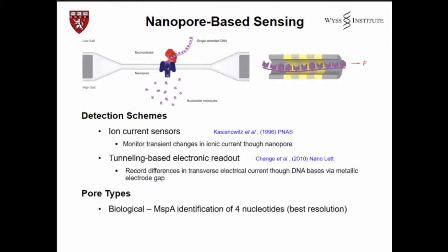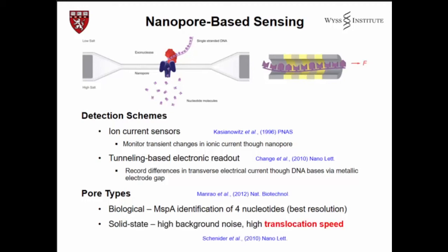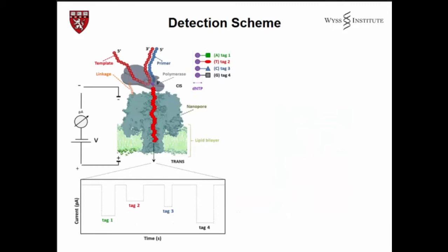I'm going to focus on a biological nanopore, and I'm going to give you a brief description of what we already published before. And it's going to be a nice bridge to the Cas9 work I will briefly describe. So we connected a single DNA polymerase to the protein pore. We embedded this in a lipid bilayer over a CMOS sensor array. So below every protein construct, there is a sensor, and I will detail it a little bit more in the next slide.